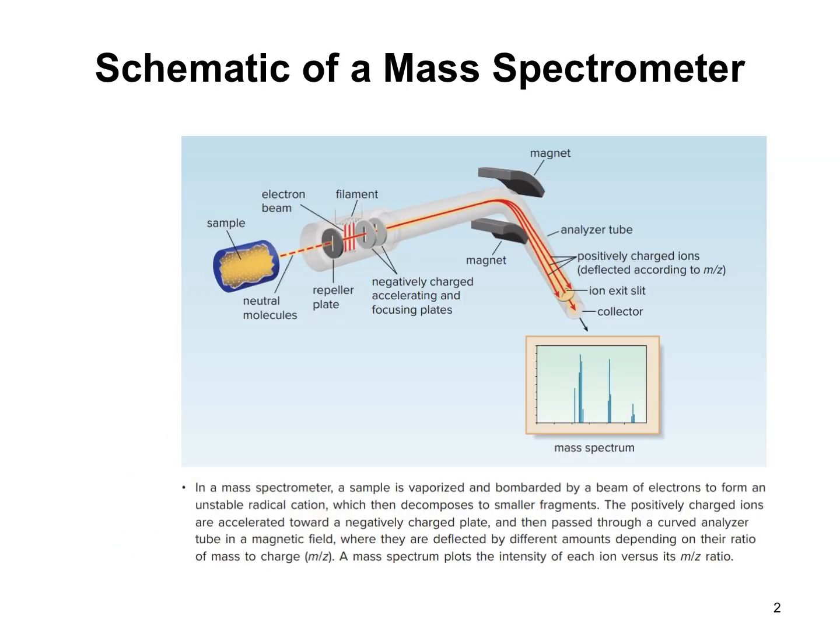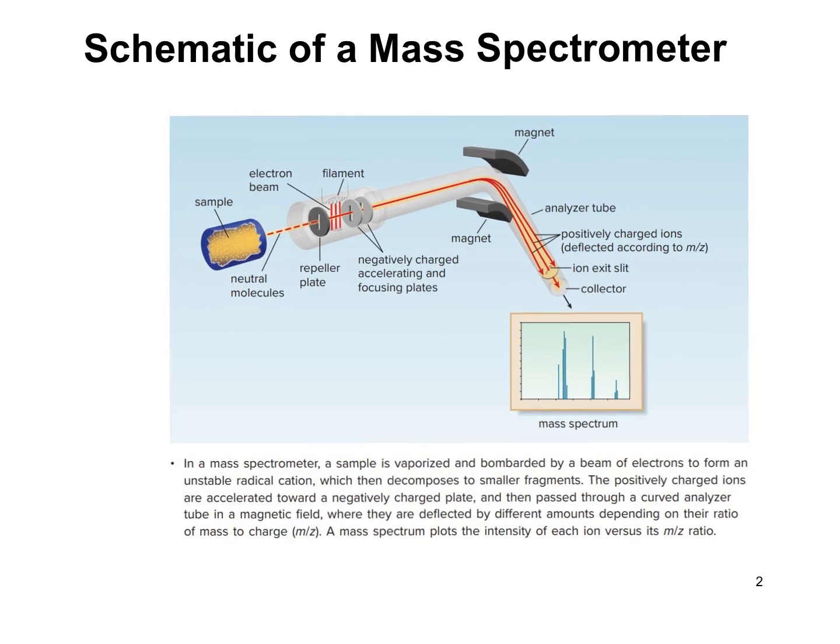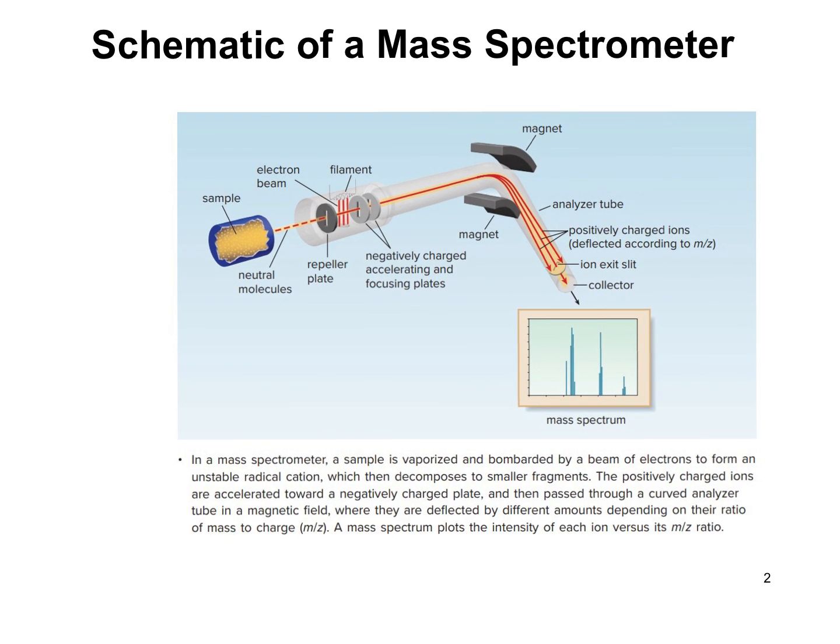So let's look at a cartoon of a mass spectrometer. In a mass spectrometer, we have a sample that is injected, and that molecule is vaporized.